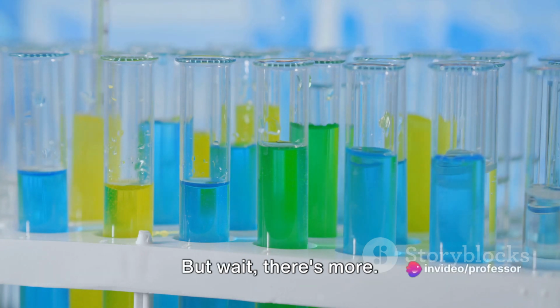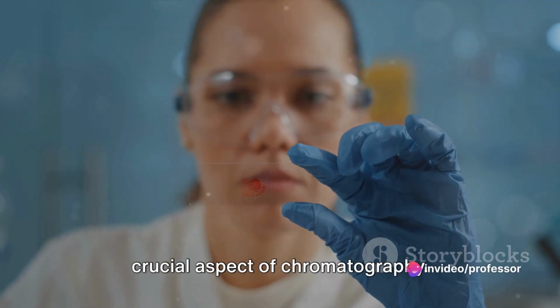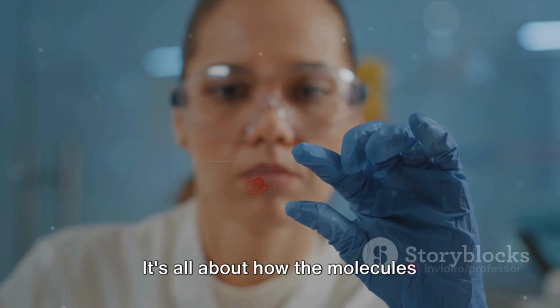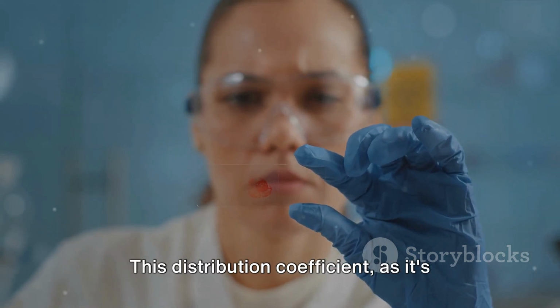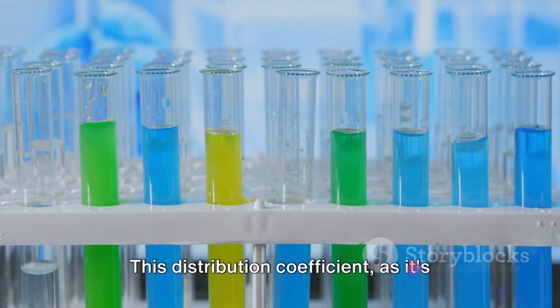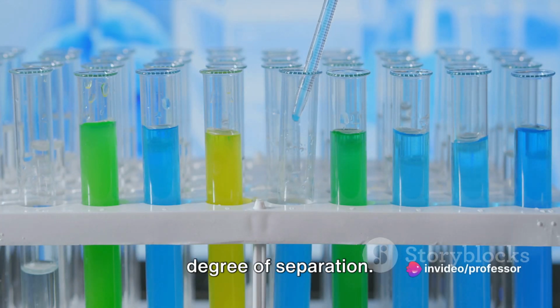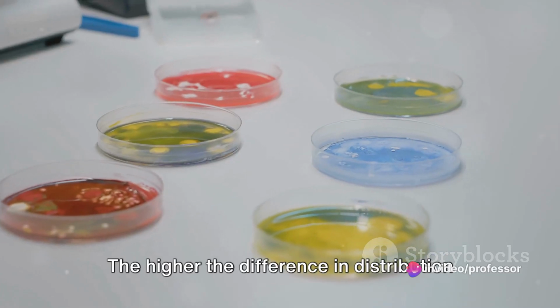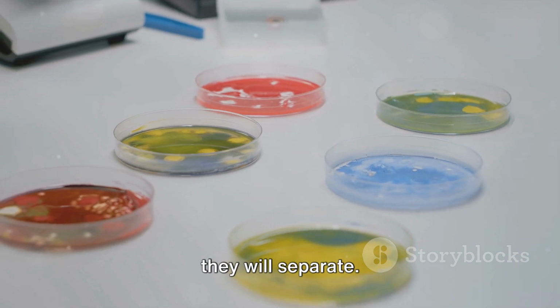But wait, there's more. The distribution of molecules is another crucial aspect of chromatography. It's all about how the molecules distribute themselves between the stationary and mobile phases. This distribution coefficient, as it's called, is a major factor influencing the degree of separation. The higher the difference in distribution coefficients of two molecules, the better they will separate.